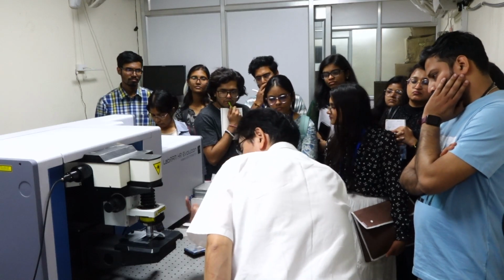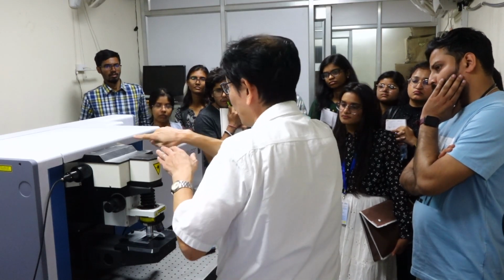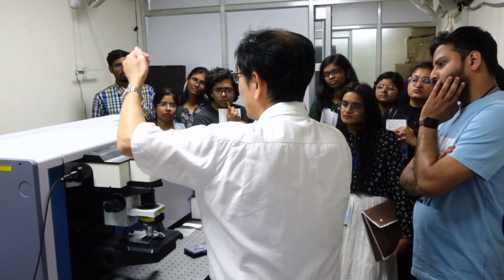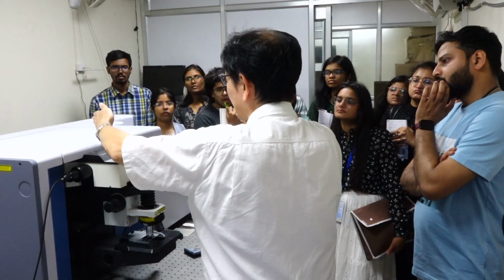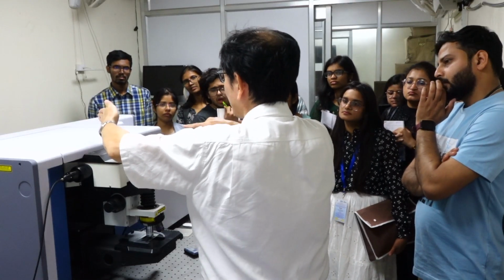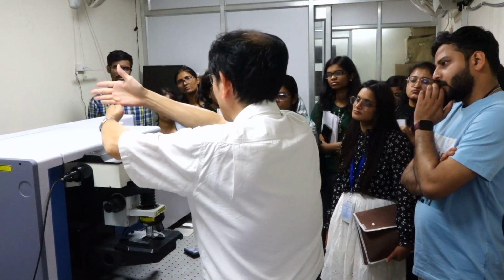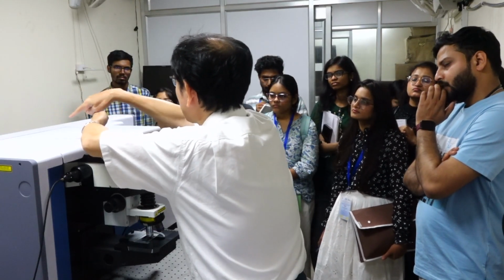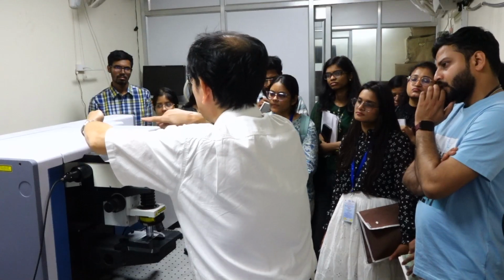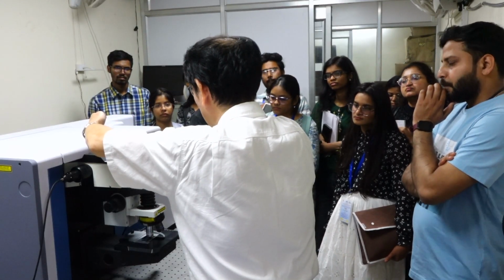Then the signal returns to some route. And there is a dichroic mirror. A dichroic mirror passes wavelengths shorter than the cutoff wavelength. So 633 or 785 passes through. Then it focuses onto the sample, and the beam is scattered.